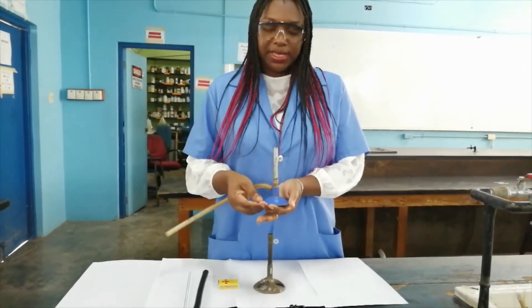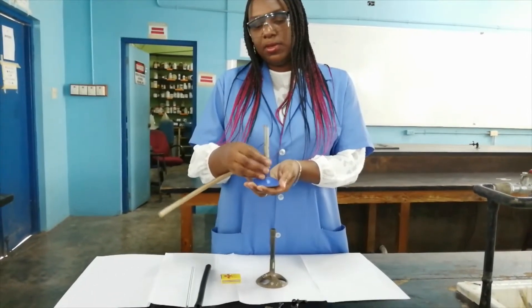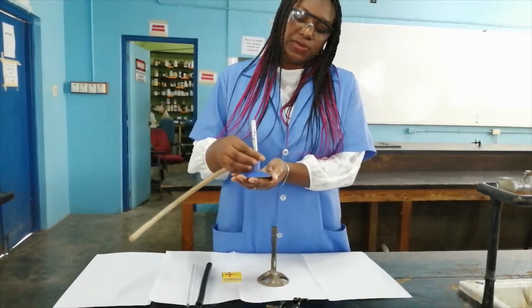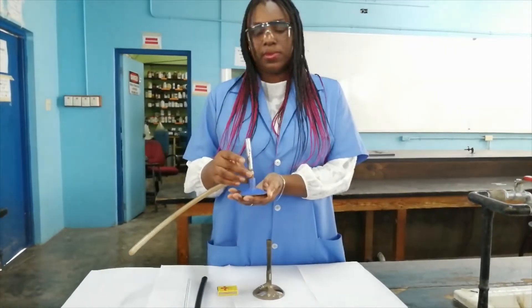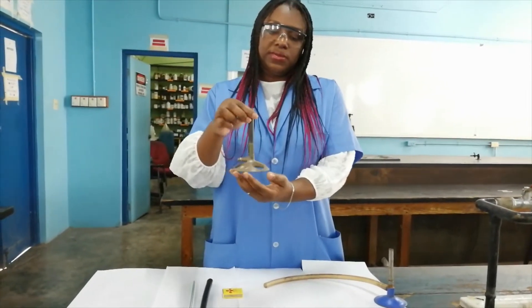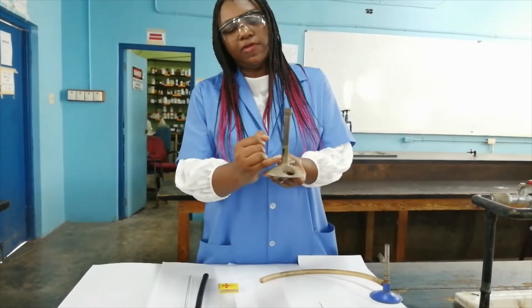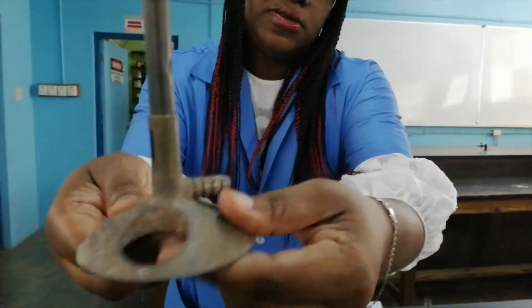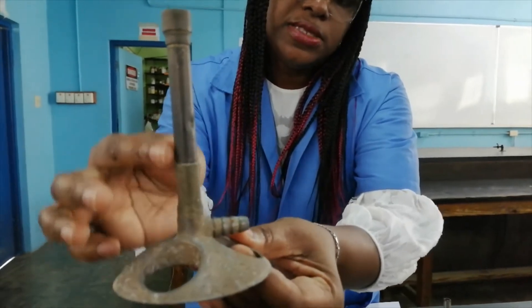With this Bunsen burner we have a base and we have a barrel. At the bottom of the barrel you will have two air holes. To open and close the air hole we simply unscrew or screw up the collar. So again we have the base, then we have the barrel, and inside of the barrel you will see the gas inlet right there. This bar is where you connect the gas hose, so that allows gas to flow into the barrel.